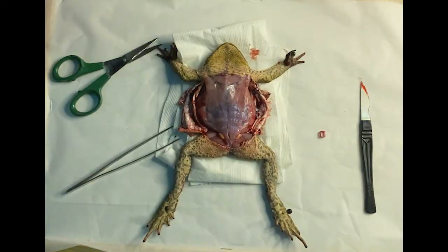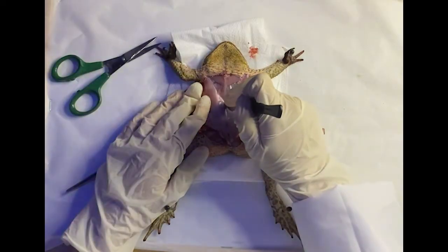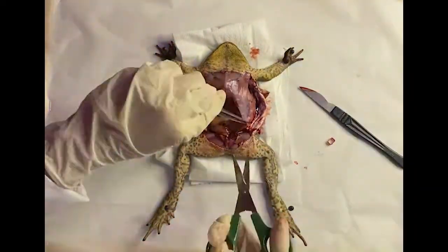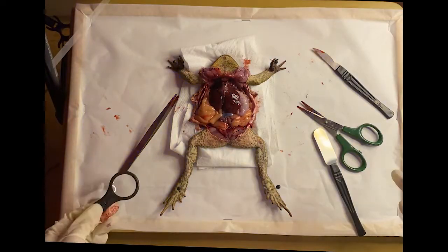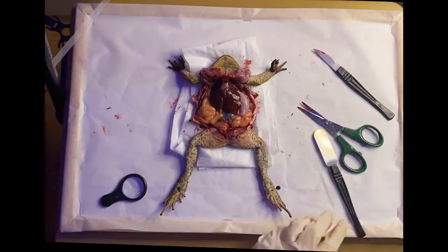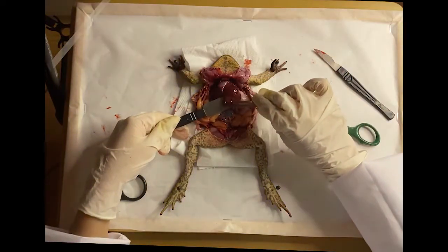After cutting through his skin, we can now see his muscles underneath. And finally, the frog's internal organs are exposed and ready to be examined. I will now be exploring and trying to identify the organs.